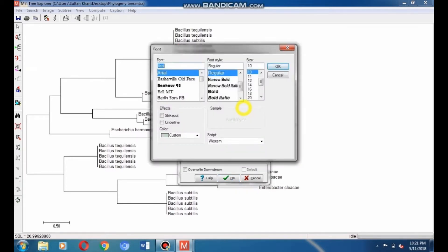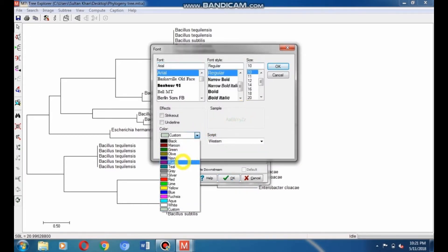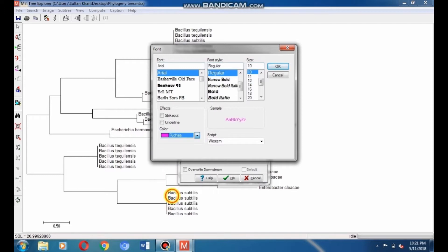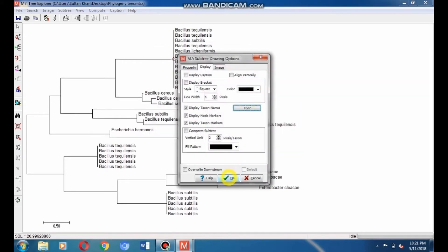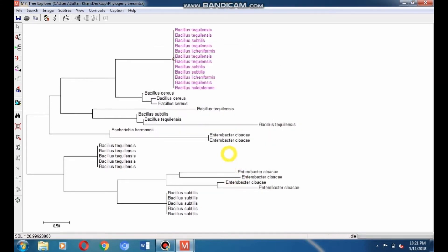Go to the Font option and select a color for the taxa of this clade. I select fuchsia color. You can also change the font style and font size by choosing your desired font size, then click OK to apply all these changes. Here you can see that the color of all the taxa of this clade has changed to fuchsia.